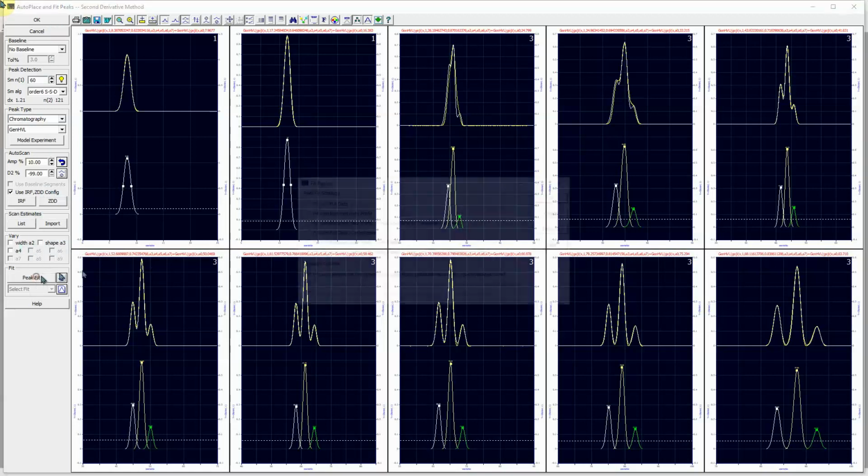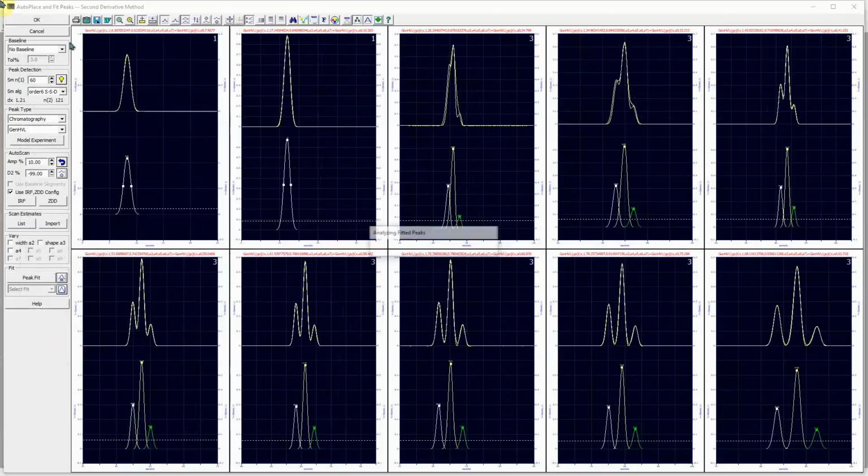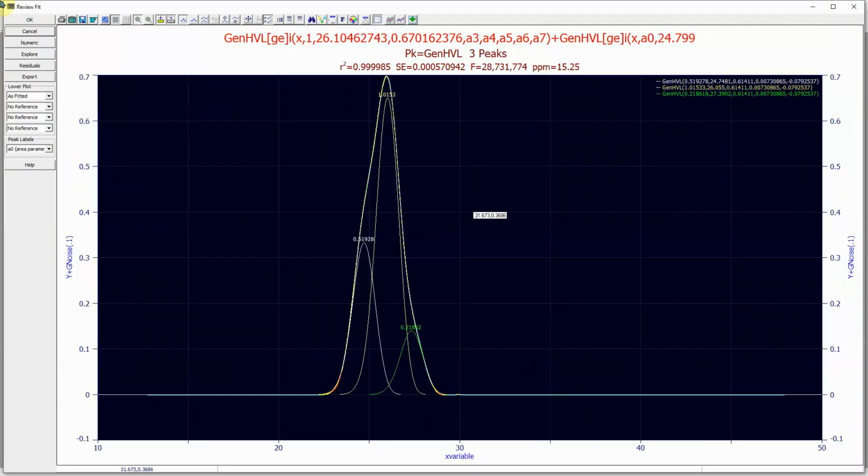We will proceed to fit this generalized model to the three different peaks. We have respectable fits except for these last three where we were worried about the over deconvolution, and we can see the errors are a fair bit higher. We've over deconvolved. We've taken the IRF was larger than it should be, and the fit immediately reflects that. So we're interested primarily in the smaller lengths. We will look first at the 30.